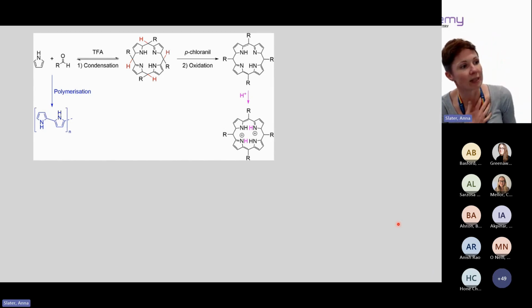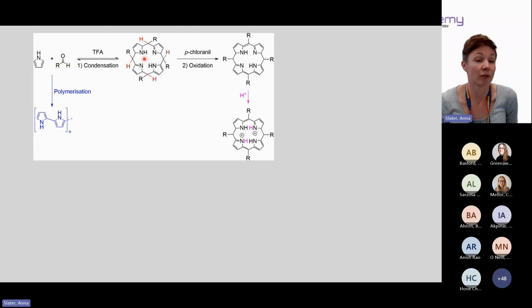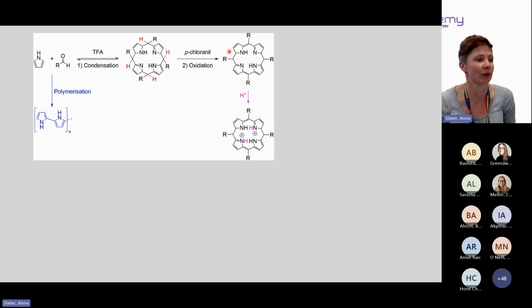And you may have done some porphyrin synthesis if you're in the audience. I just thought I'd go over a little bit of what the challenge is here. We start with pyrrole and an aldehyde, in my case, quite a sterically hindered aldehyde. And we do a reversible condensation reaction, not dissimilar to imine chemistry in some ways, with an acid catalyst. I was using boron trifluoride dietherate, but you can use TFA, to form this porphyrinogen, which you then oxidize. I was using a lot of DDQ, but you can use chloranil, to this porphyrin species here. I think some of the double bonds have gone missing, but we make a porphyrin here.